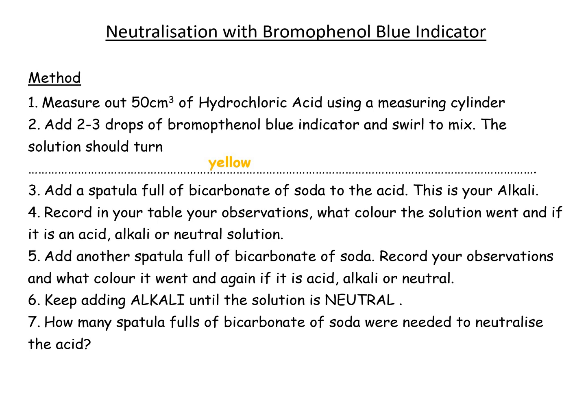Now ideally you'd be taking it to neutral for neutralisation, but when we're adding spatulafuls we don't have that same control as when we can add things dropwise. So it's quite possible that we're going to overshoot neutral.